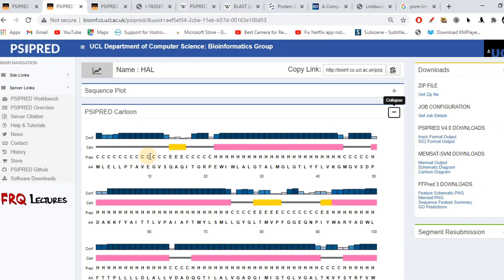There is a difference between ITASER and PSI-PRED here. In ITASER, beta sheets were represented by S, but in PSI-PRED, E is used for beta sheets. Alpha helices are still H and coils are C — the only difference is this E instead of S for sheets. A is amino acid, pred shows the prediction in alphabetic form, and colors are given to the three components of secondary structure.